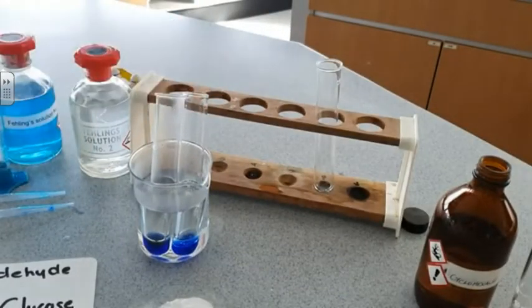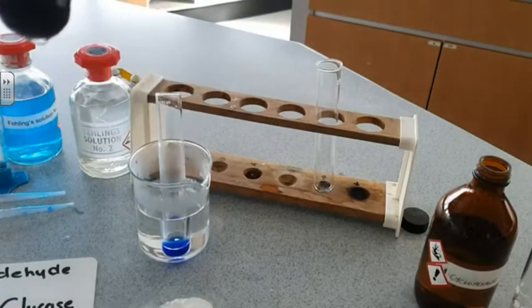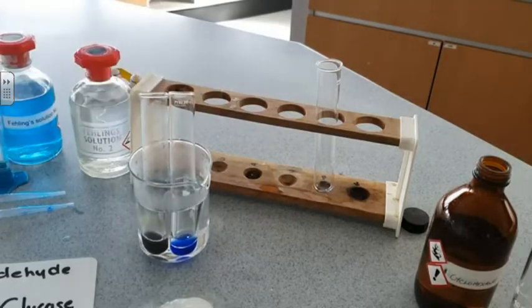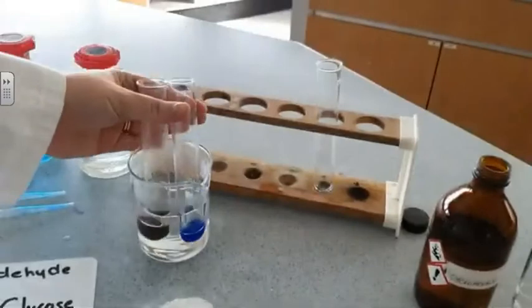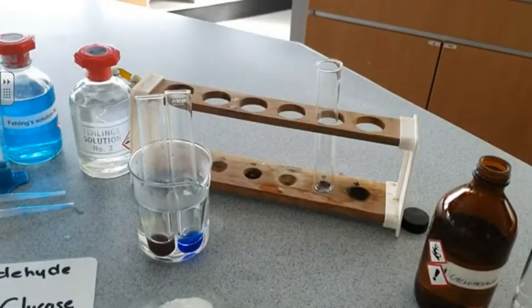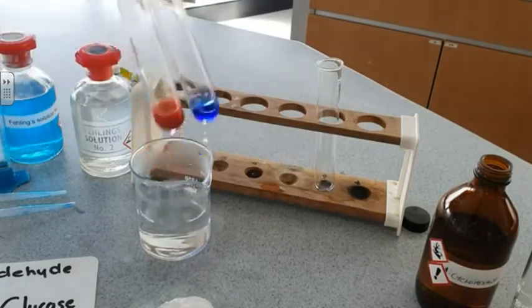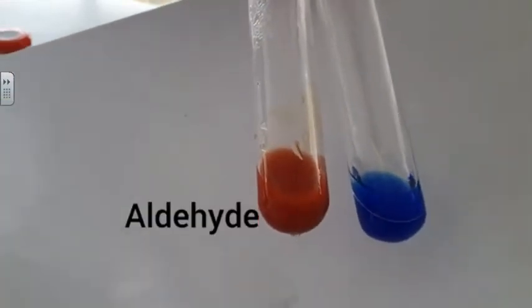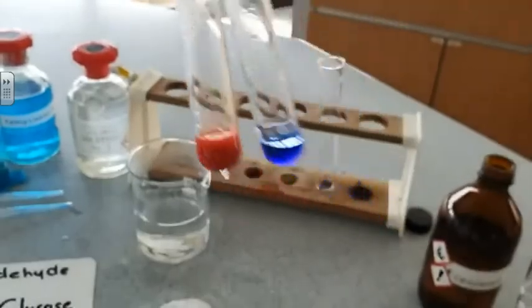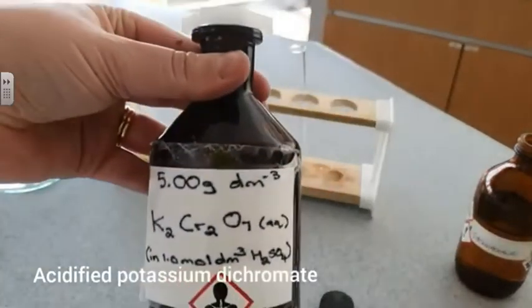On the left we've got Fehling's with our aldehyde, and on the right we've got Fehling's with our cyclohexane. You can see that in the test tube on the left there is definitely a reaction occurring, and now you can see that eventually over time there's definite formation of a brick red precipitate in the test tube on the left, and in the test tube on the right nothing has happened, no observable change. So the glucose contained an aldehyde group, but the cyclohexane did not.